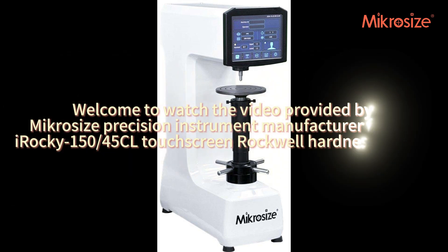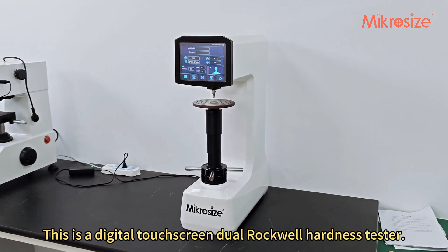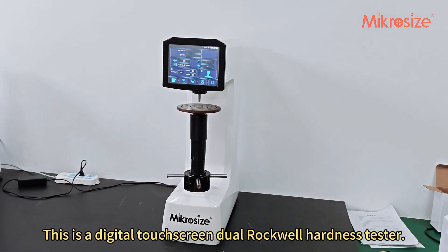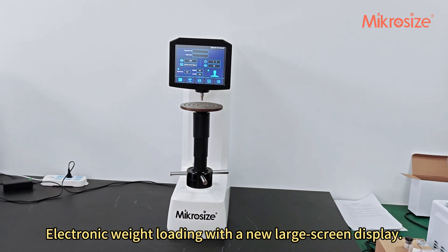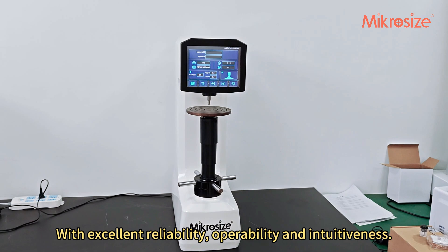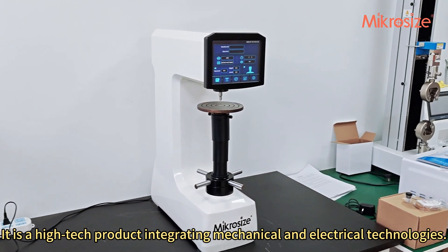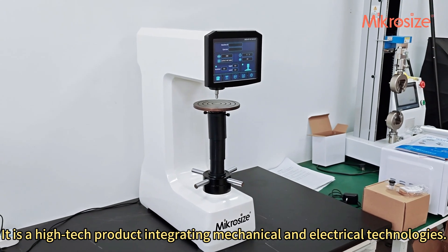Welcome to the video provided by Microsize Precision Instrument Manufacturer for the iRocky15045CL Touchscreen Rockwell Hardness Tester. This is a digital touchscreen dual Rockwell Hardness Tester with electronic weight loading and a new large screen display, offering excellent reliability, operability, and intuitiveness. It is a high-tech product integrating mechanical and electrical technologies.